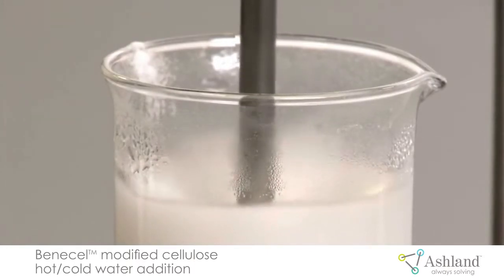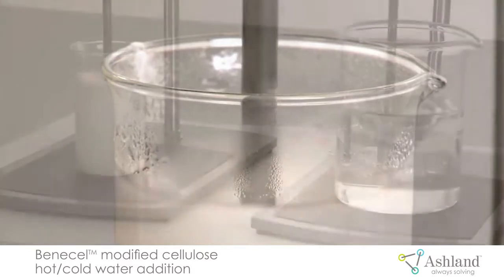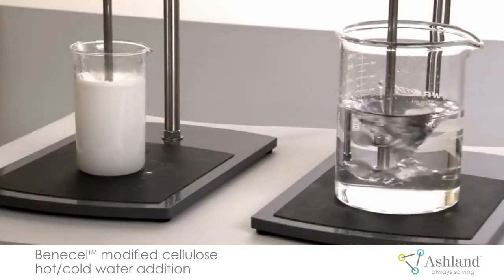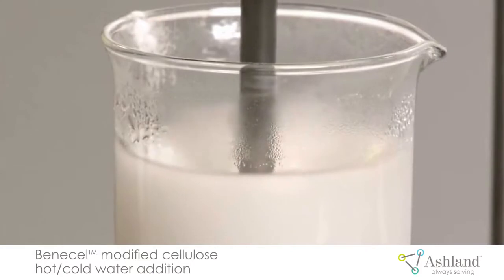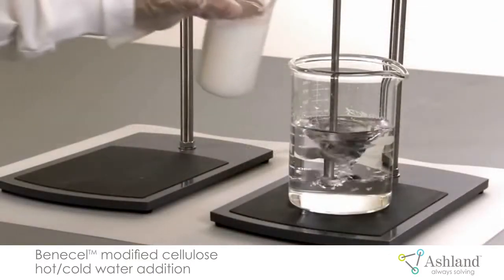We can increase the speed of the mixer to pull in the powder and disperse it completely. All we are doing is dispersing the powder in the hot water so that it will not lump. The hydration will happen when we cool the solution down.